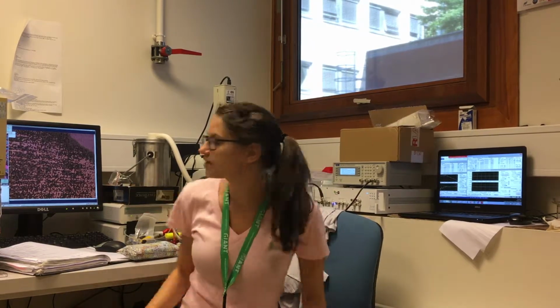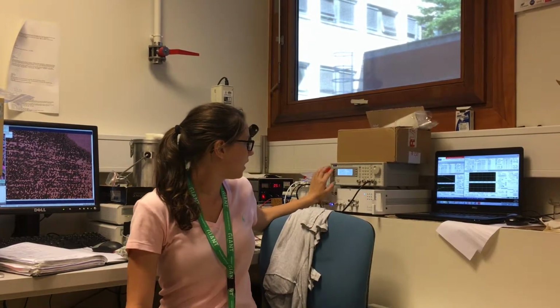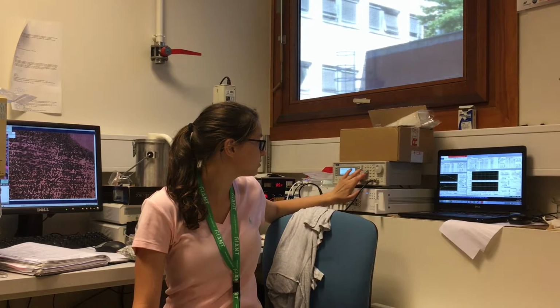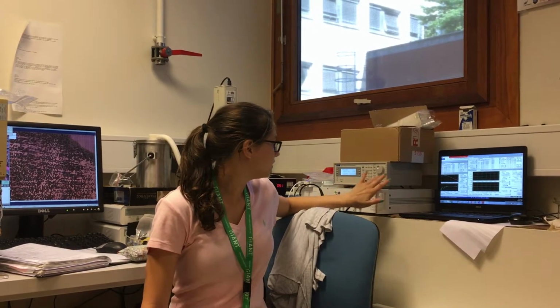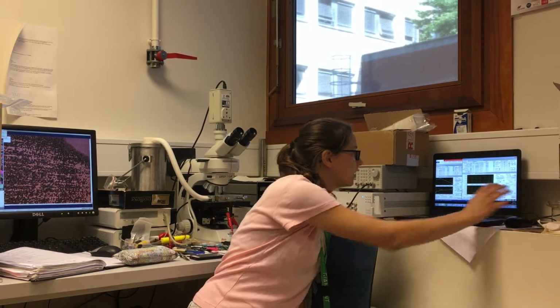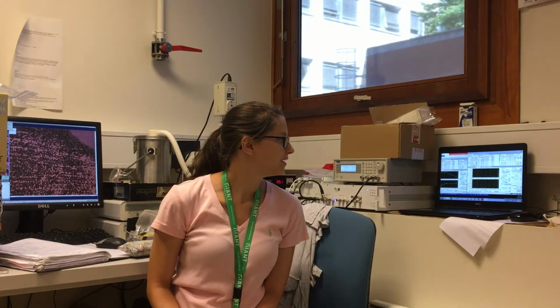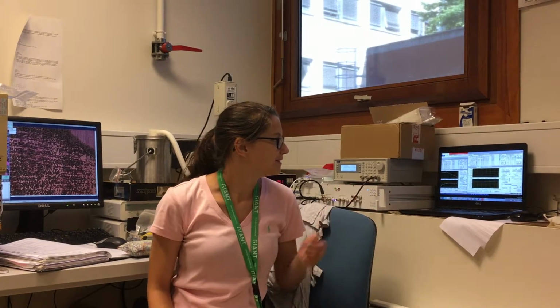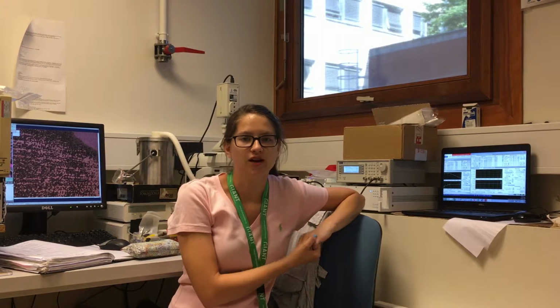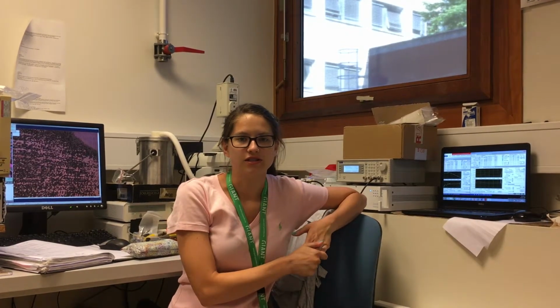But right now I'm just taking some baseline measurements so that we can see if there's a change at all when we add the nanoparticles and apply the same electric field strengths. So I'm at 33 degrees Celsius right now. I'm going to apply an electric field strength of 0.25 volts. We will start taking the measurement, and it takes about 6 minutes to sweep through the measurement. But as you can see, measurements are taken, and this is ultimately just a measure of the electrical properties of the cell, and we can use this to get the electrical resistance or conductivity.